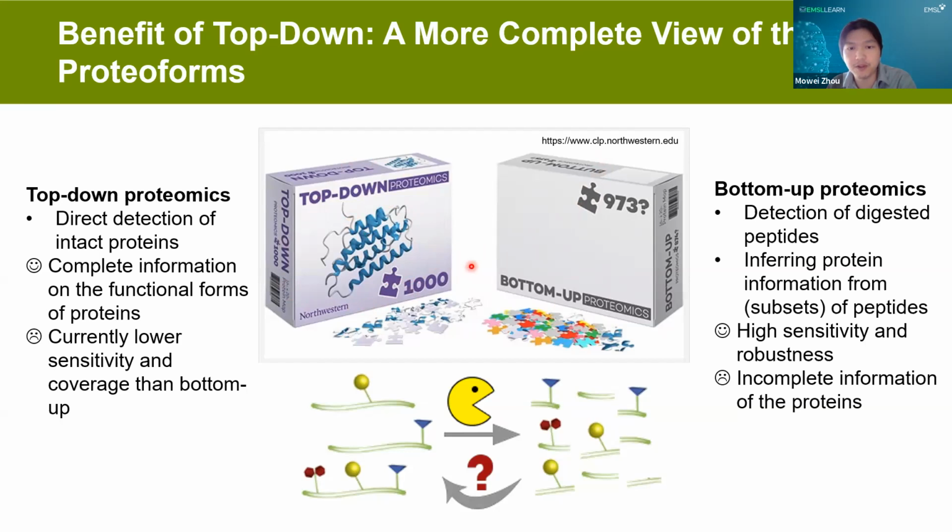We can better piece the smaller pieces together if we combine top-down and bottom-up analysis. Although currently top-down is more challenging to perform than bottom-up, with the new developments in the field, we're really hopeful that top-down will become more common practice with efforts from the community.